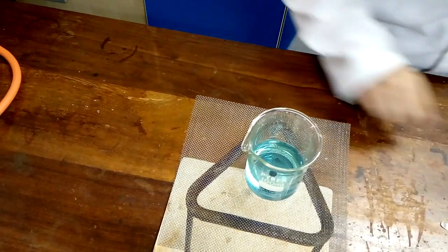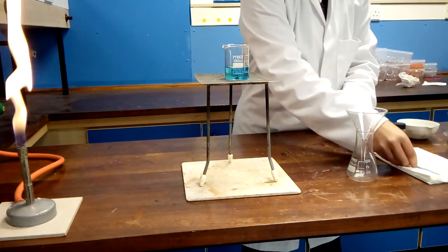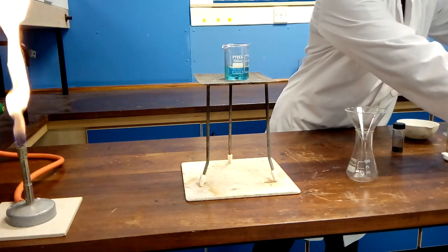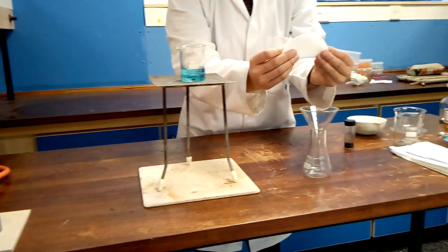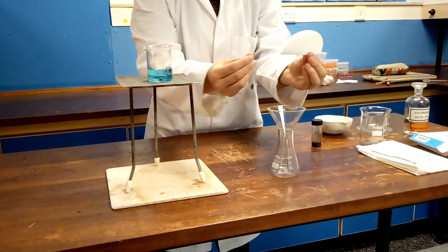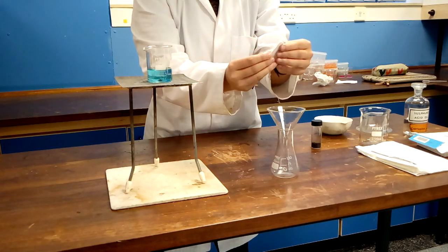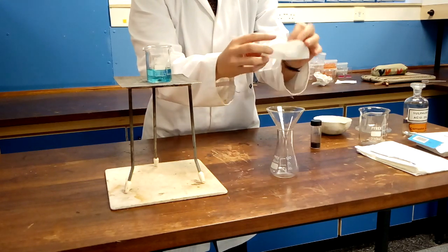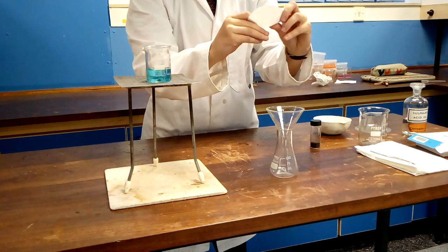To remove the unreacted copper oxide you will have to filter the solution. While you're leaving your apparatus to cool you can set up the filtration. For this you'll need your filter funnel and conical flask. Fold the filter paper into half and then quarters. Adjust to a cone shape to fit the funnel.